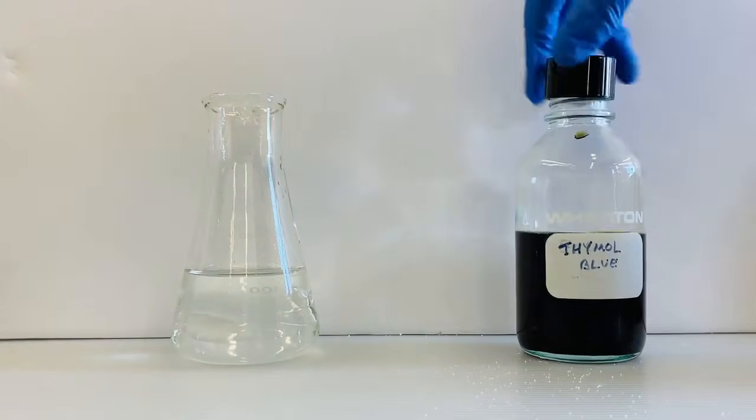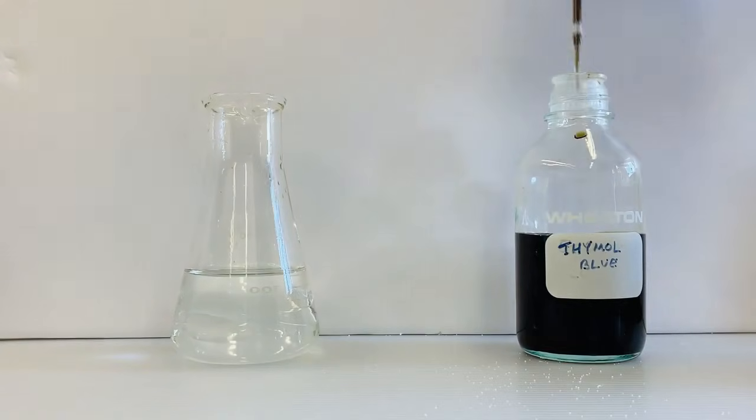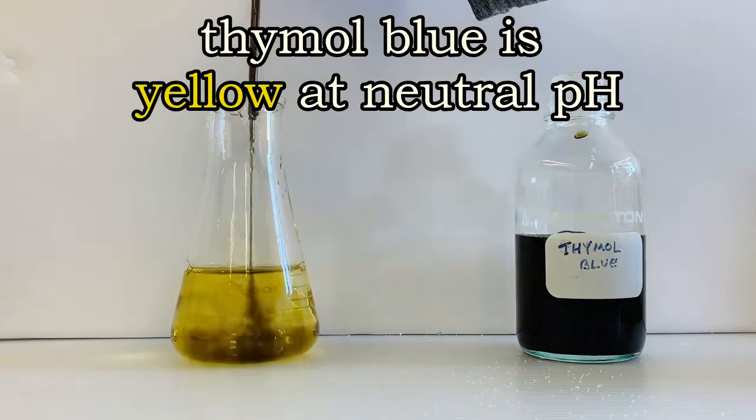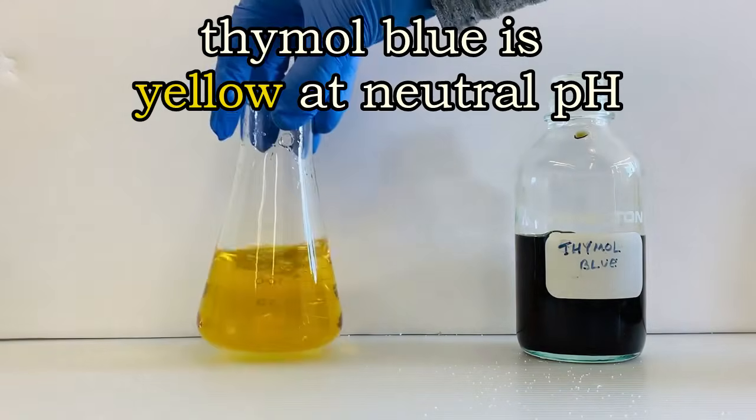Let's investigate the properties of thymol blue so we can understand the color changes a little bit better. We see that if we add thymol blue to water, which is close to neutral in pH, a yellow color results.